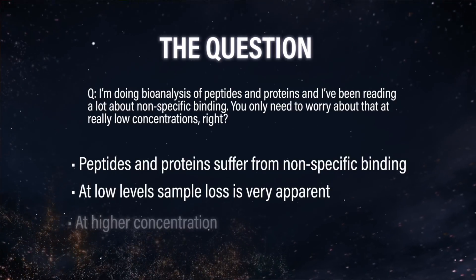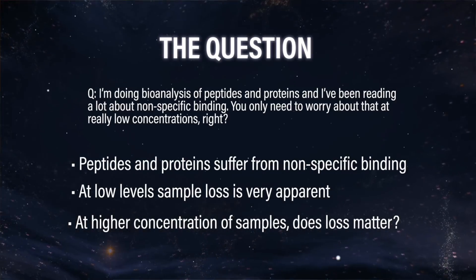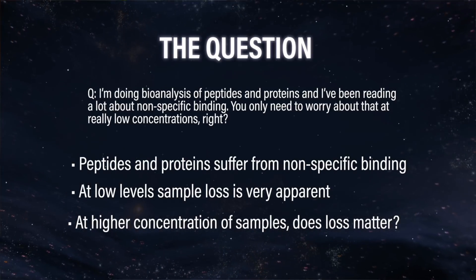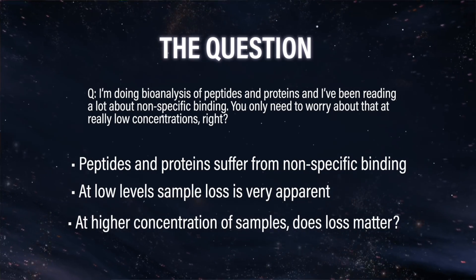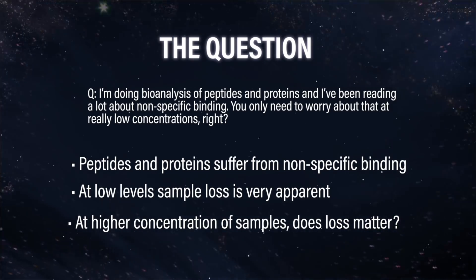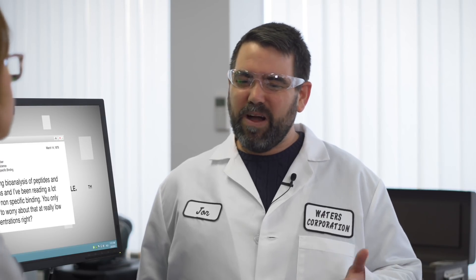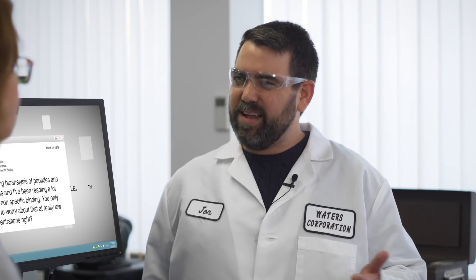At higher concentrations of sample, even if you lose a little bit, does it matter? I've read in some papers where people try to get around this by either injecting large concentrations of a different protein, or maybe using some sort of a surfactant — though probably not PEG, because that gets all fouled up in your MS. Some sort of surfactant to try to minimize these types of interactions.